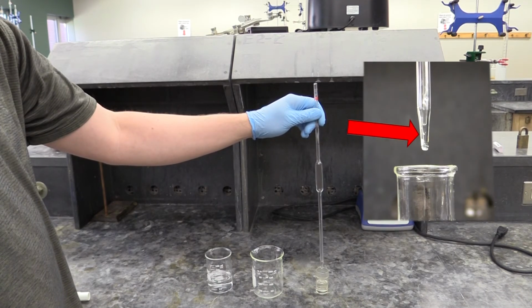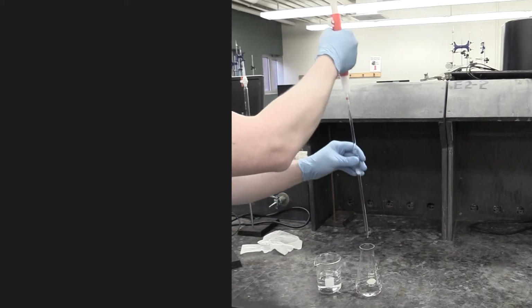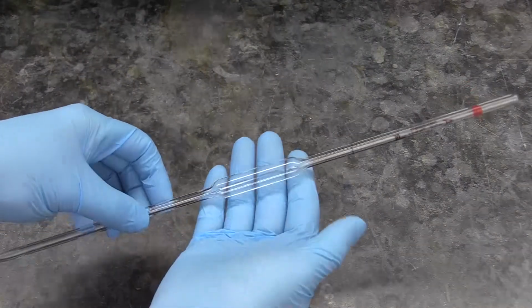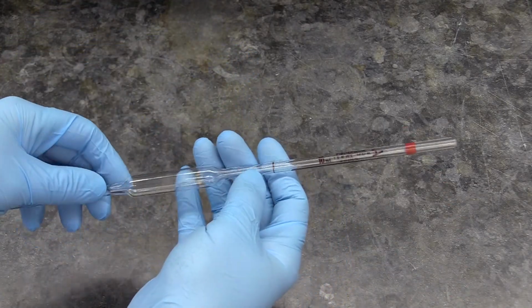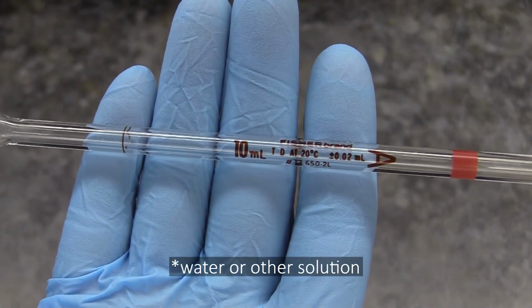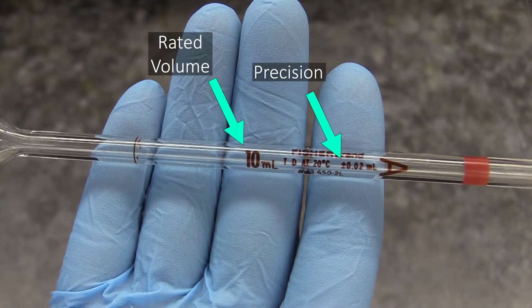If you look close, you'll see a small bit of solution will get left behind in the pipette. It's calibrated to account for this, and this is why you don't want to use the pump to force the liquid out of it. You'll note that, unlike a beaker or a graduated cylinder, your pipette has no graduation marks to read. The amount of water you dispense with it is whatever it's rated to dispense, which is etched or painted somewhere on the pipette's side, along with its precision.